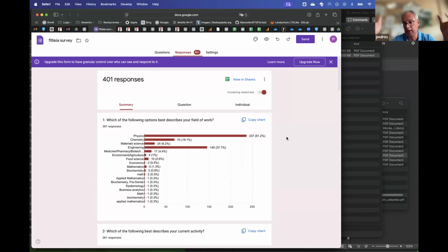It's certainly not the best, but it is flexible enough to deal with all the problems that I have faced so far, including the most complex thing I did, which was this COVID data analysis with the differential equations. And if it is able to deal with that, I can deal with pretty much everything, if you want. So that's what is in the fitting engine, right?